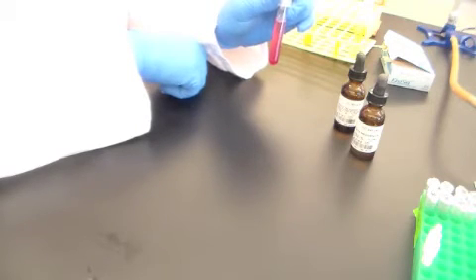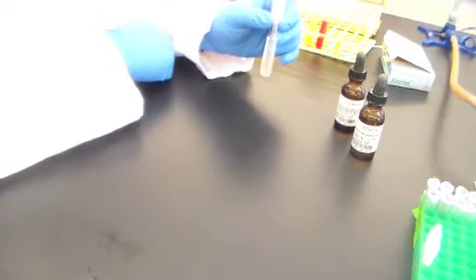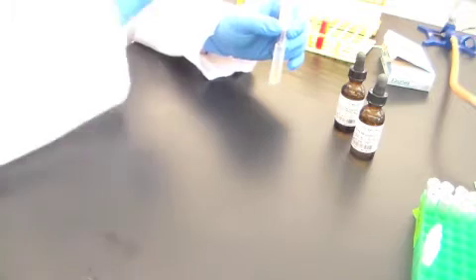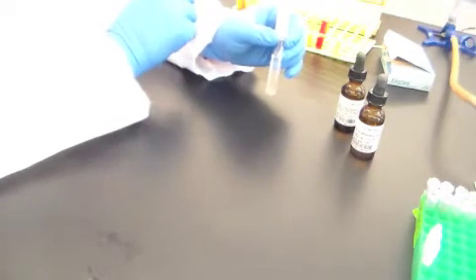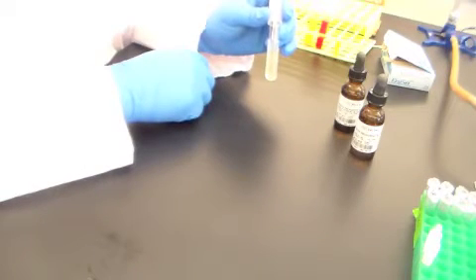Okay, let's imagine that this result had come out as I expected it to, in which there was no red color. The absence of red color could be due to two possibilities, so this is why the nitrate test is a little bit confusing. A negative result like this, after adding nitrate A and B, as I did in this uninoculated culture, could indicate that the bacterium was simply incapable of reducing nitrate to nitrite.